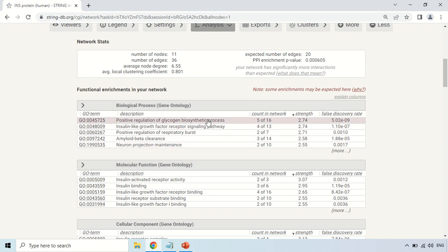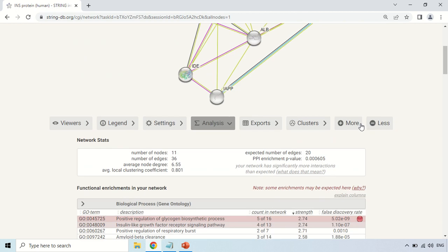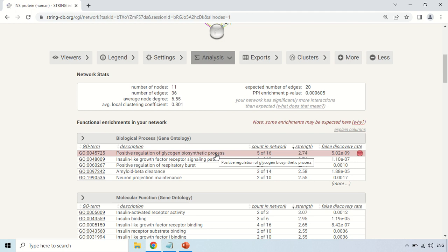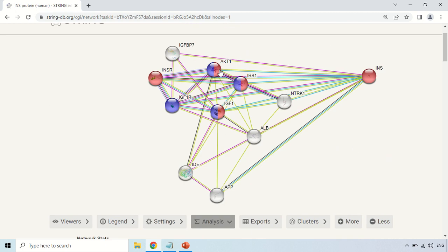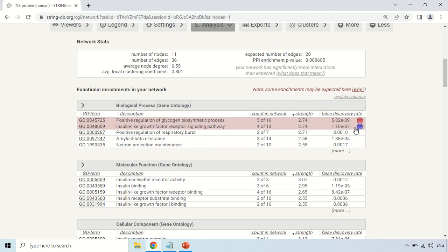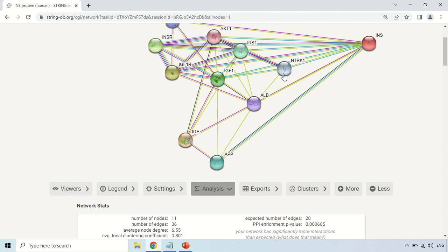In order to know which protein is involved in a particular function, for example the first one is positive regulation of glycogen biosynthetic process, just click on the name of this pathway. Now you can see red dots appear — all nodes that turn red are involved in this pathway. If you click on another pathway, like insulin growth factor receptor signaling pathway, those nodes become blue. Nodes that are both red and blue are involved in both of these pathways. You can click again to deselect it. By clicking on any pathway, it will be highlighted in this diagram by different colors.